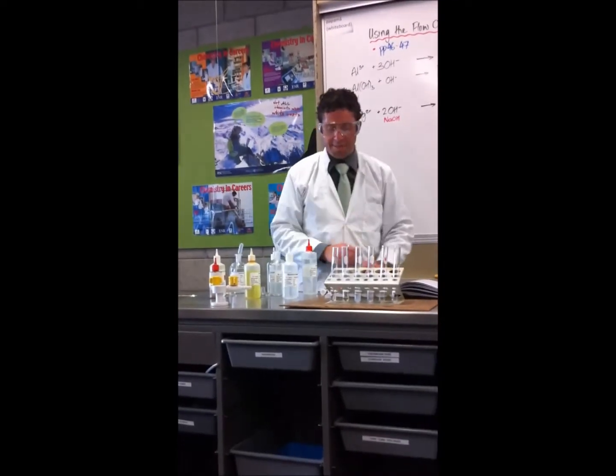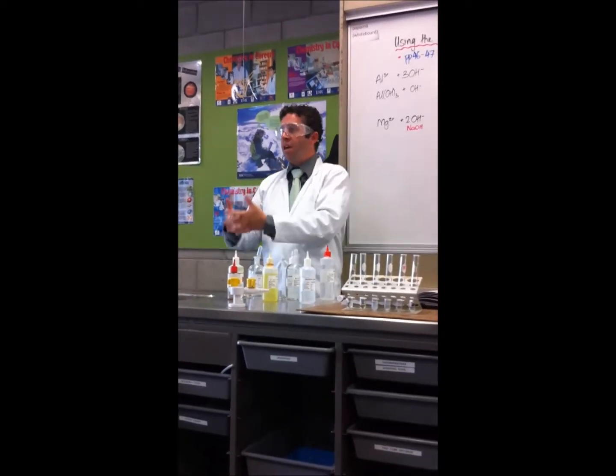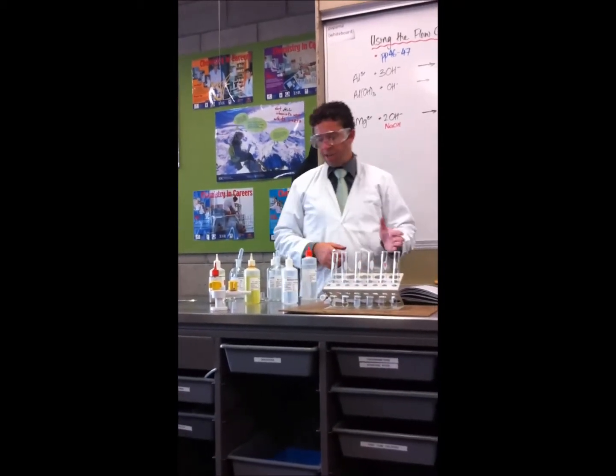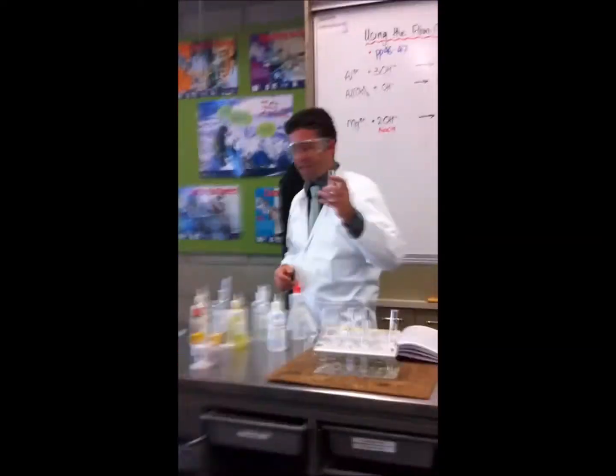Yeah, or you'll see some others where it's not hydroxide, but it might be the ammonia complexing, or the thiocyanate complexing, or the iodide reacting. Okay, so I've done that one there. I'm now going to get another one just to see what happens. I might need to rinse some of those out.